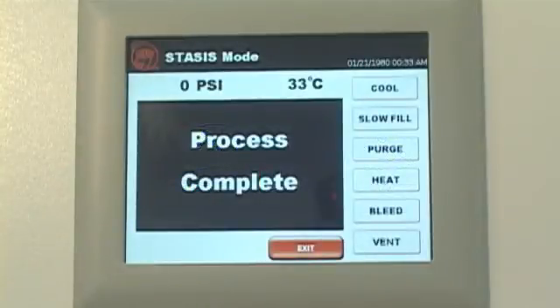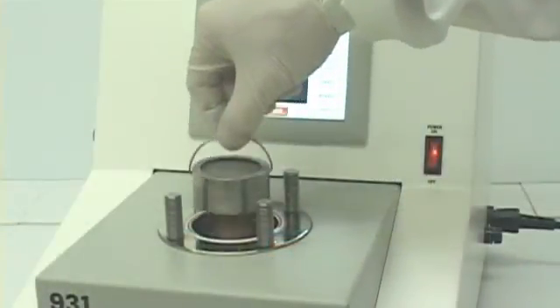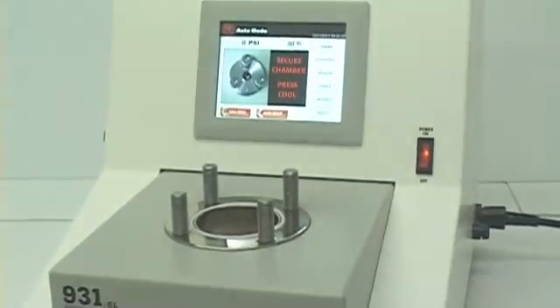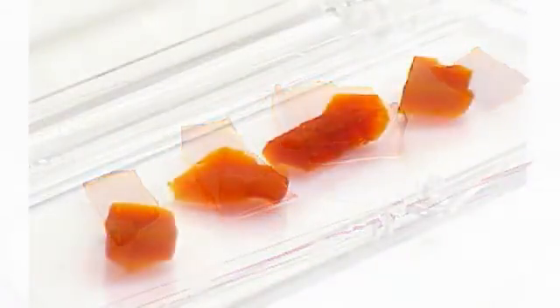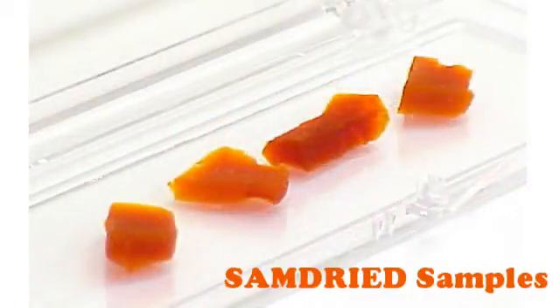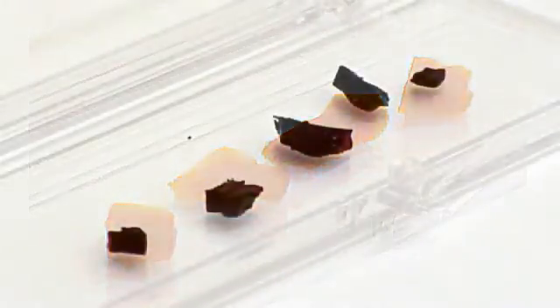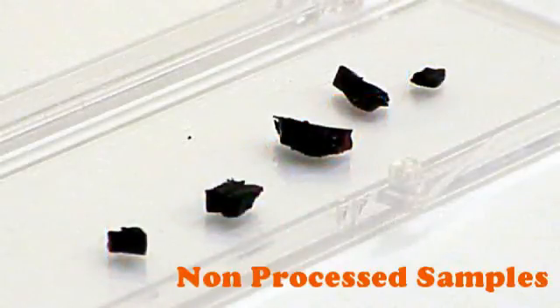Upon completion of the process, the samples can be removed from the chamber. What was a saturated wet sample has now successfully dried, with its structural integrity intact. The sample and its structure has been freed from any of the stiction forces caused by residual internal fluid.